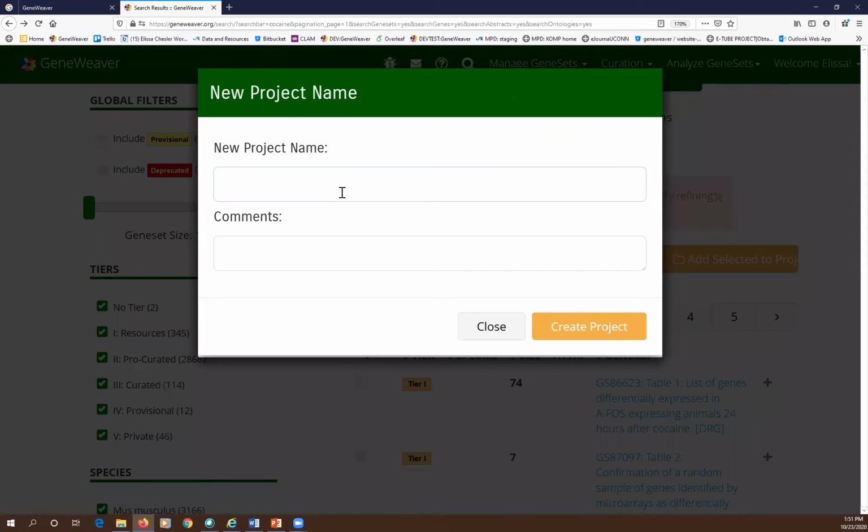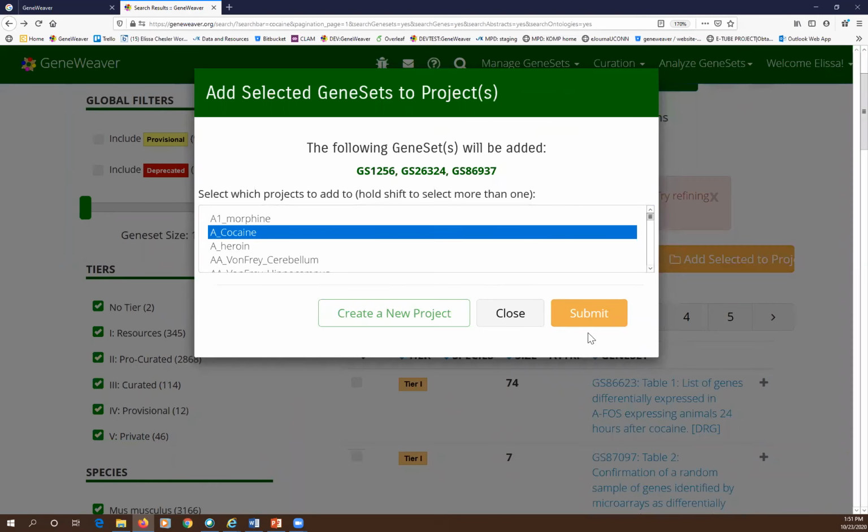Called AAA cocaine. Oh yeah, right. It should be AAA or AA Palmer cocaine. Not as good. And then I create that project.